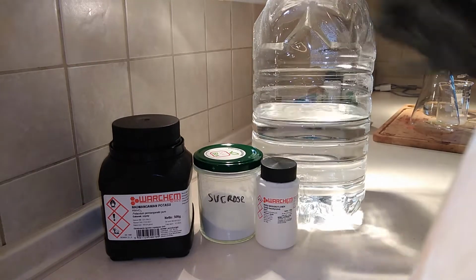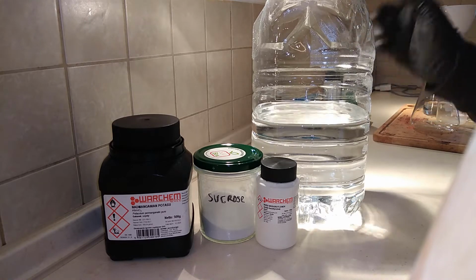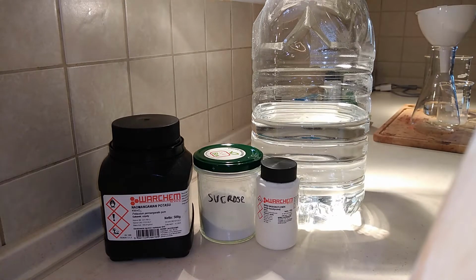And here, obviously, distilled water. Water can obviously be used straight out of the tap. I did it and it works. But distilled water is a lot better because there are fewer contaminants and less stuff that can mess the reaction up. So let's get right into it.